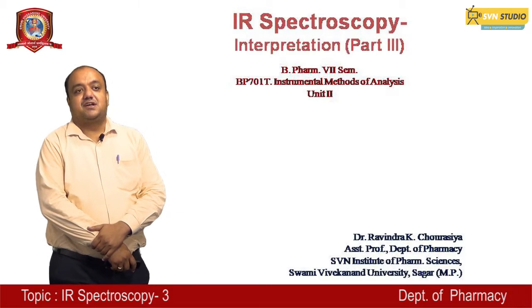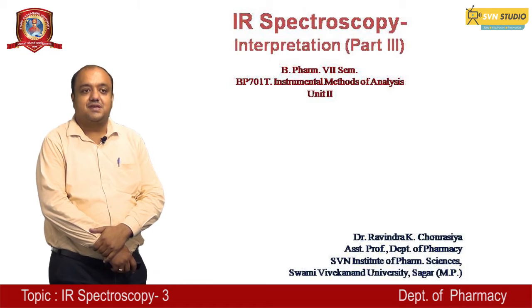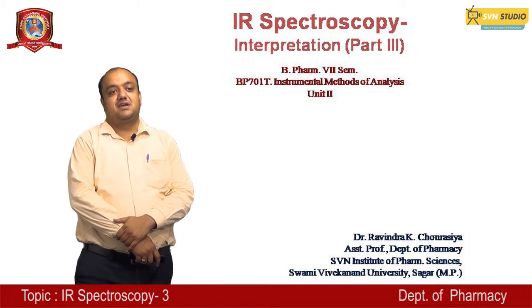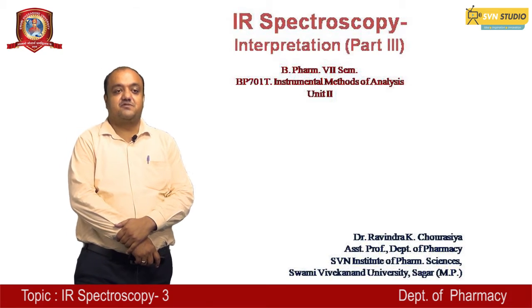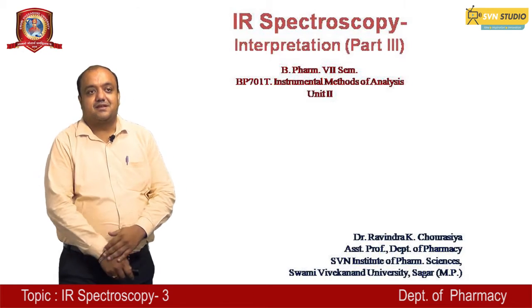I am presenting here the interpretation of IR spectroscopy, which is useful for B.Pharm 7th semester in Instrumental Methods of Analysis, BP 701T subject, in Unit 2.